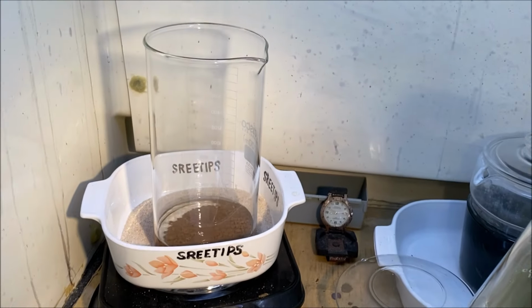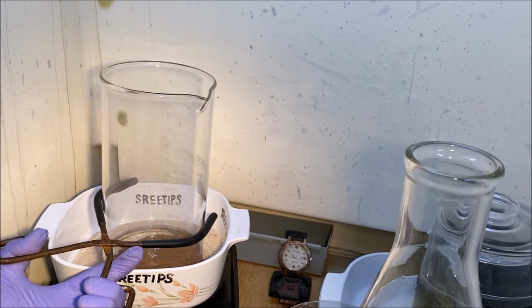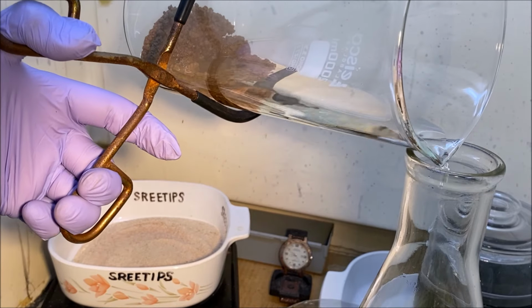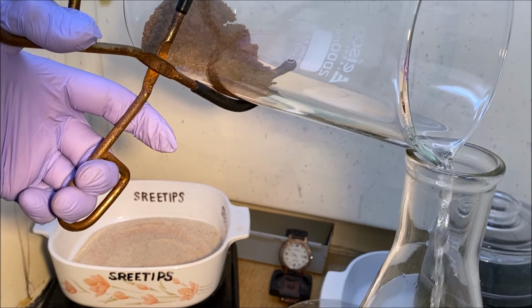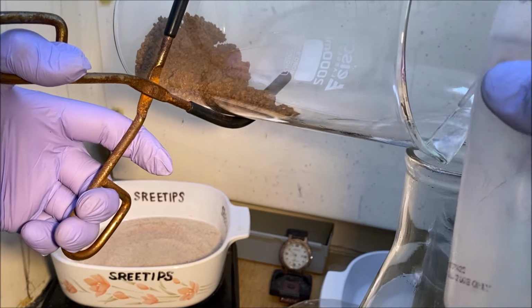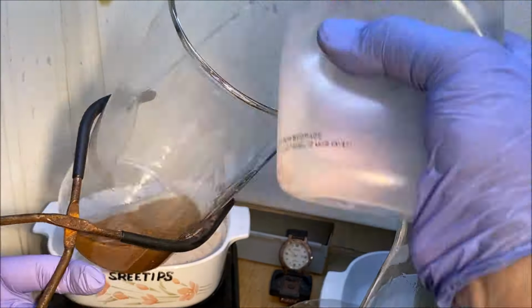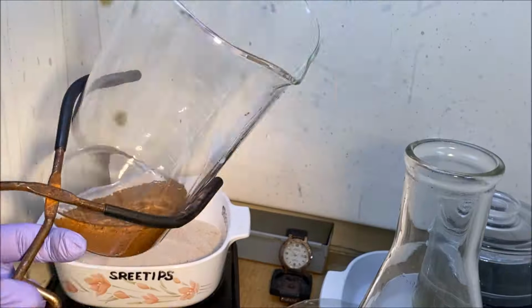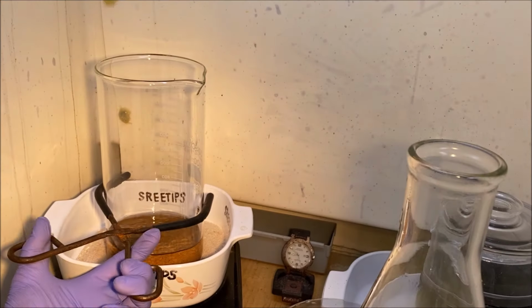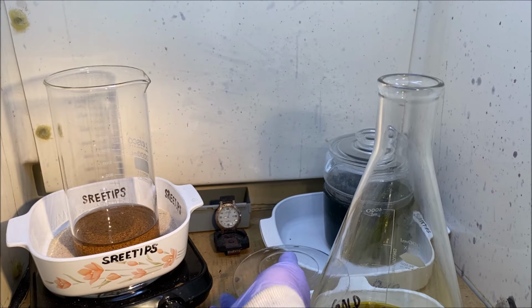Just continue to rinse this off. Get this hydrochloric acid rinse off of here. Now rinse it with some distilled water, over and over. Water boil just for good measure. I'm going to go ahead and pour this off now, this water boil.